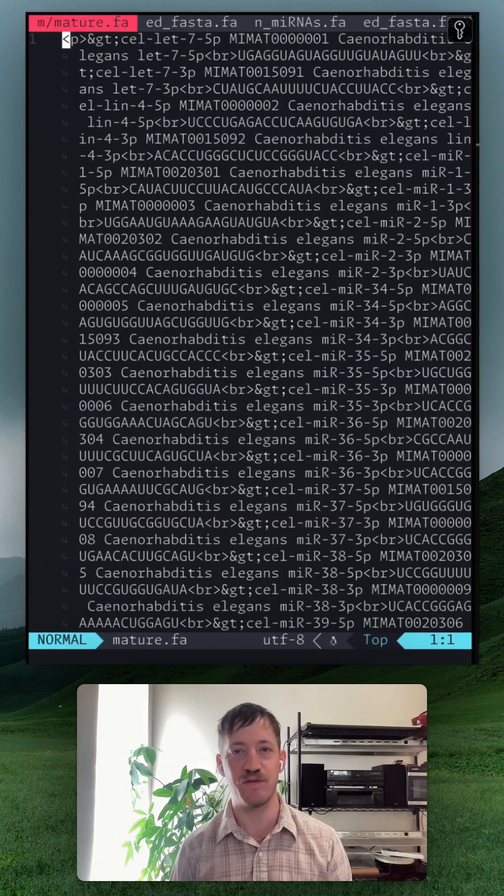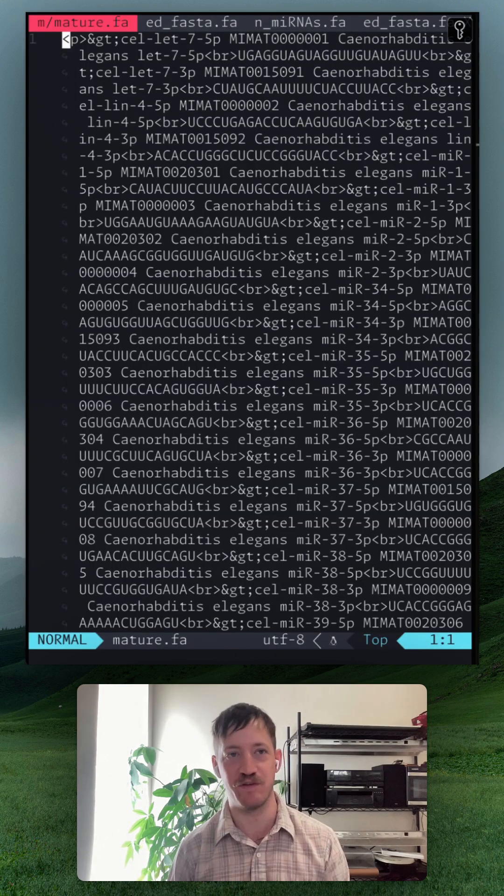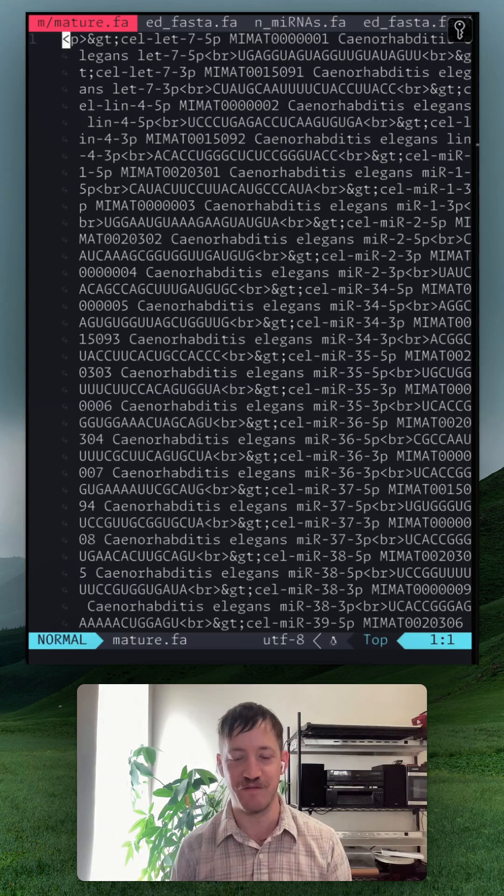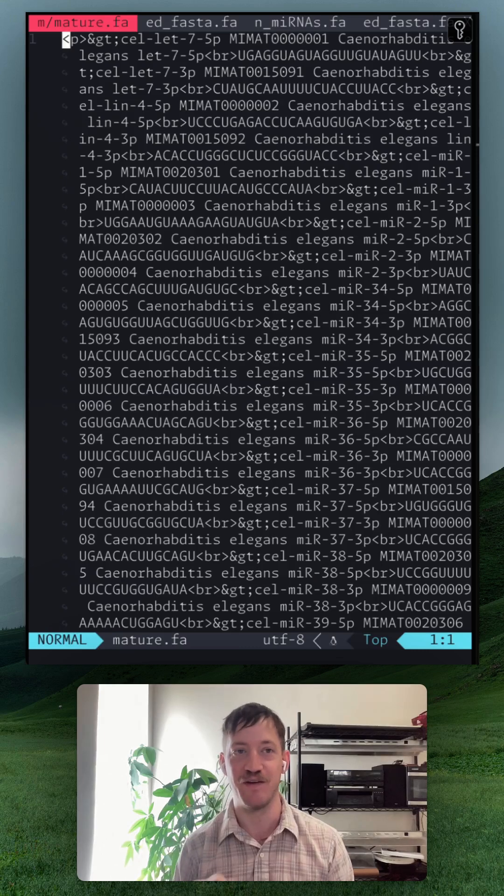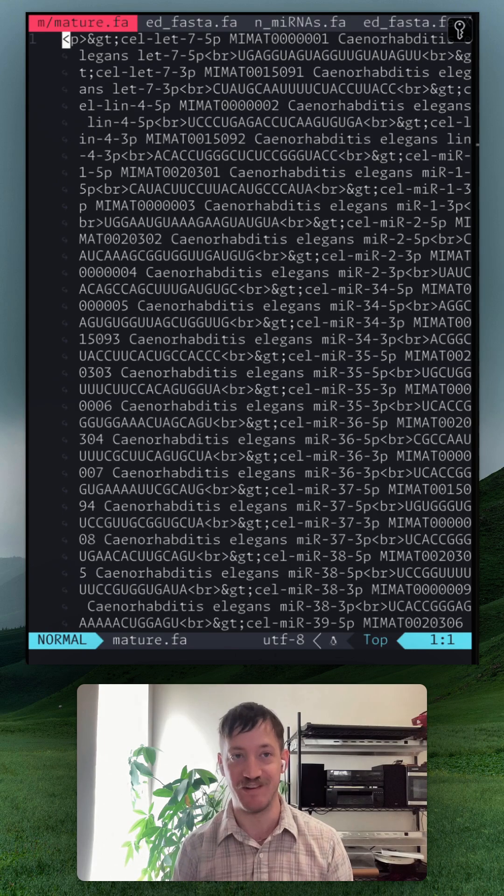When we use curl to fetch all the mature microRNA sequences from Mirabase, we actually don't get a FASTA file. We get HTML.